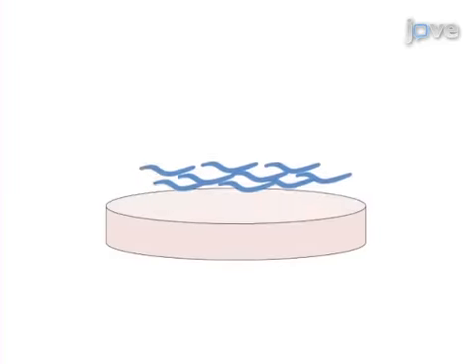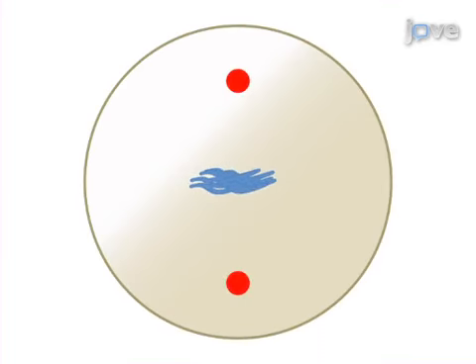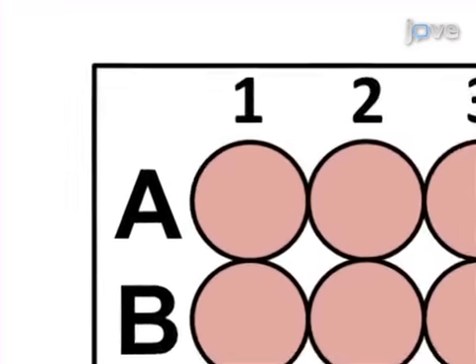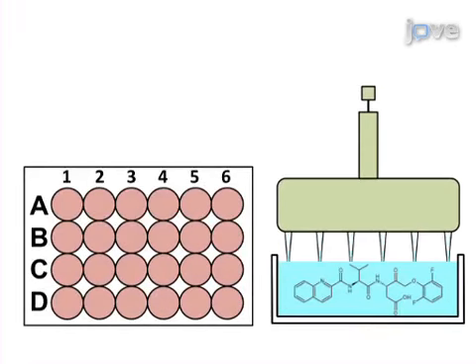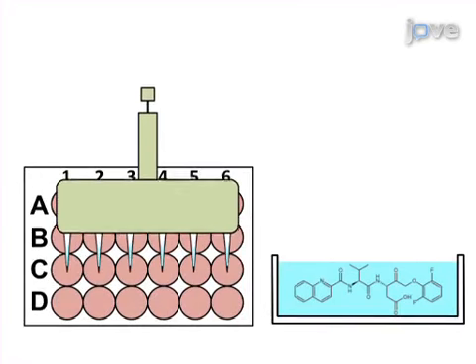Next, the behavioral consequence of expressing amyloid beta in ASE neurons is assessed by a chemotaxis assay. The third step is to obtain primary cultures of ASE neurons and then treat cultured neurons with pharmacological agents such as QVD-OPH to suppress the toxic effect of amyloid beta.